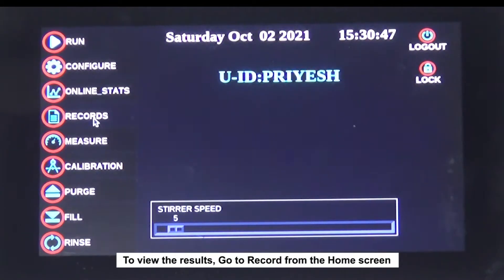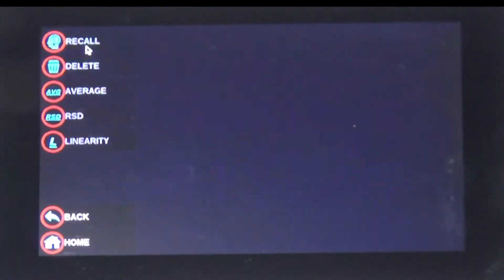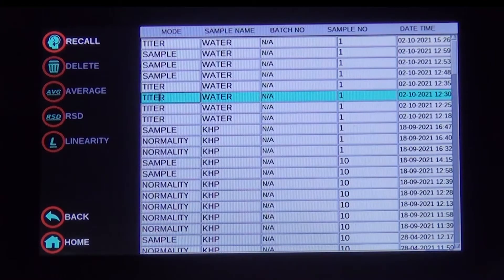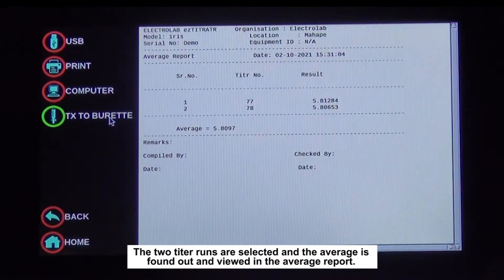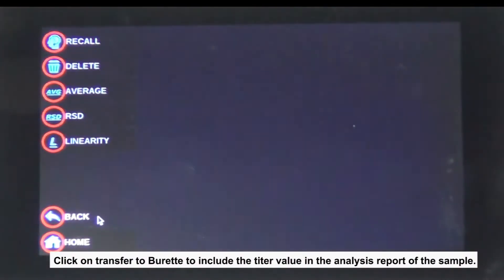To view the results, go to Records from the home screen and click on Titration. A table of all previous analyses will appear on the screen. The two titer runs are selected and the average is found and viewed in the average report. Click on Transfer to Burette to include the titer value in the analysis report of the sample.